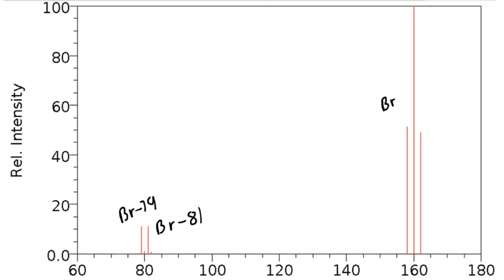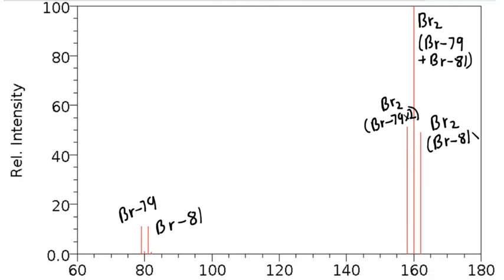Okay, so we've got two 79s making 158. We've got a 79 and an 81 making 160. And we've got two 81s making a 162. If you're into stats, you can talk with your partner about the relative sizes of these peaks. And moving on. Oh, before we move on, notice there's those little half peaks again from the +2 charges.